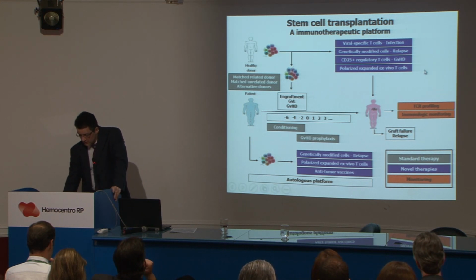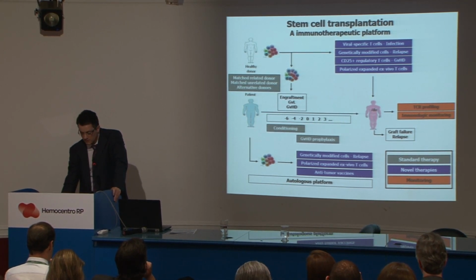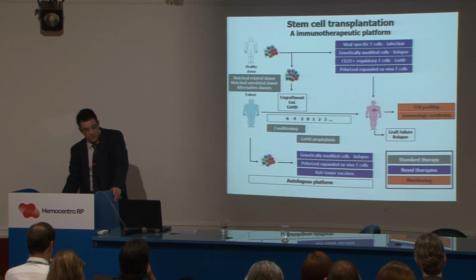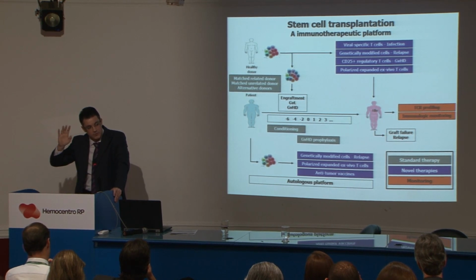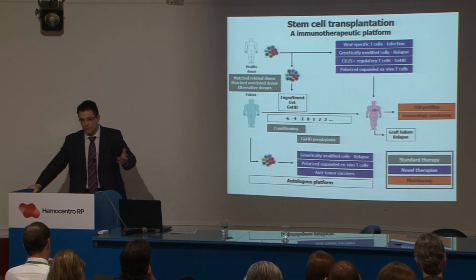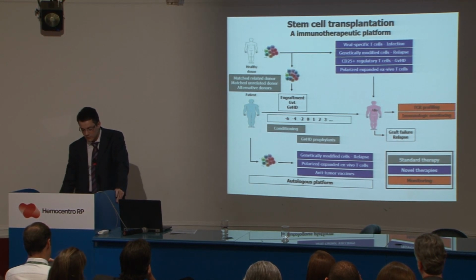And also, you can take advantage of what you have in terms of TCR profiling. Dr. Levine has shown here how the clones proliferate after infusion of cells. This is something you can learn a lot about, because you can see specific T cell repertoires that can be useful to treat patients. And also immunologic monitoring. Normally now we have flow cytometry with 13, 14 colors and many other devices that you can put in the game here to help us understand what is happening with our patients.